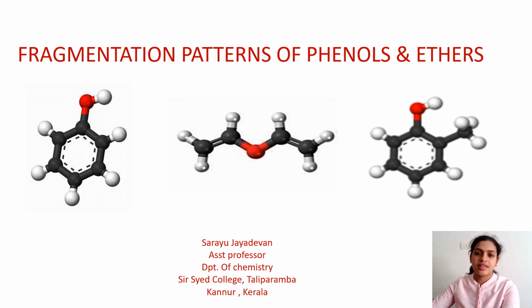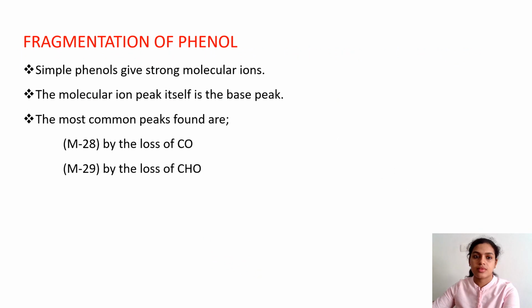Hello everybody. Today we are discussing the fragmentation patterns of phenols and ethers. Regarding phenols, simple phenols give strong molecular ions, and for them the molecular ion peak is so strong that it is itself the base peak.